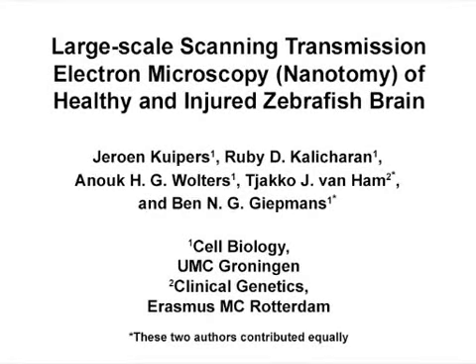The overall goal of this large-scale electron microscopy, or nanotomy, experiment is to define alterations from the macromolecular level to the tissue level, in today's case in the degenerating zebrafish brain. Nanotomy can help answer key questions in life science, for example, in neurodegeneration and in type 1 diabetes research.